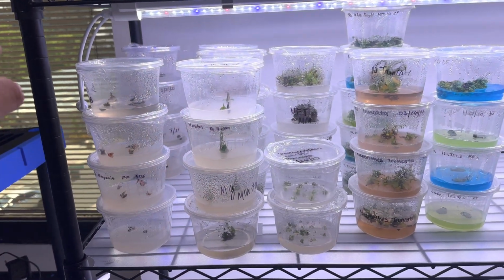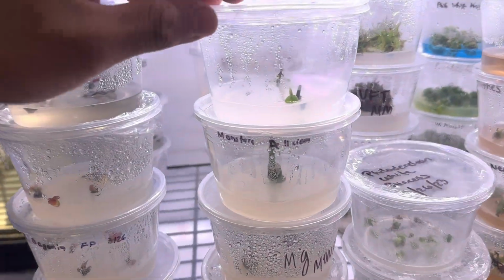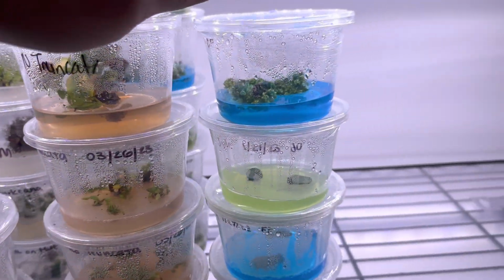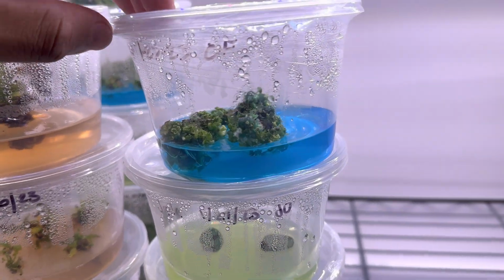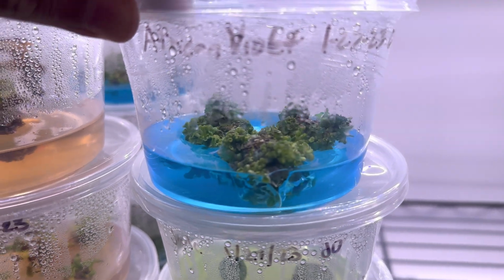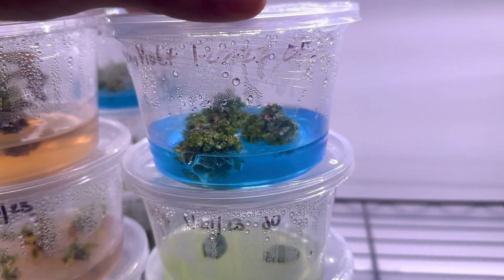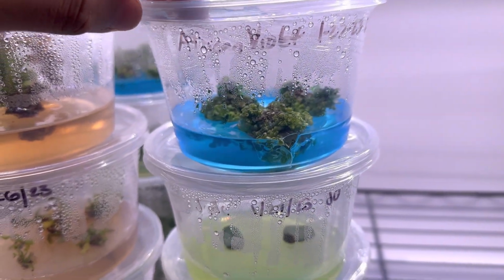Alright, so these are some of the plants from the students from the previous classes. So these are plants that we have placed in class in tissue culture. Like we show you here, this is African violet. It has all of these callus plants forming. So this is something that was made by one of our students, and look, they're looking pretty good.